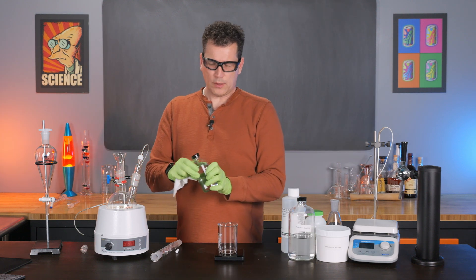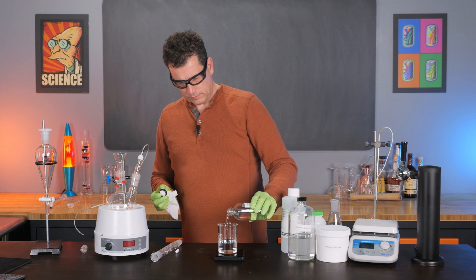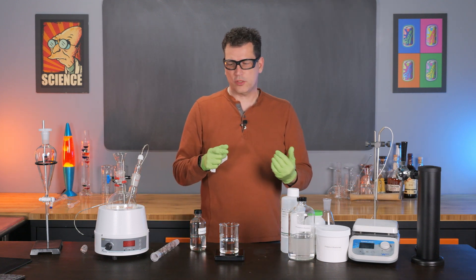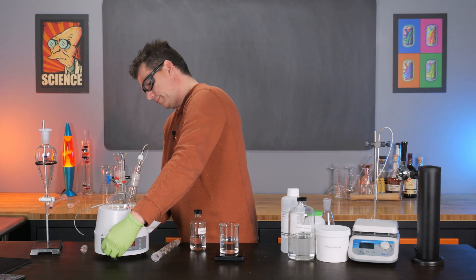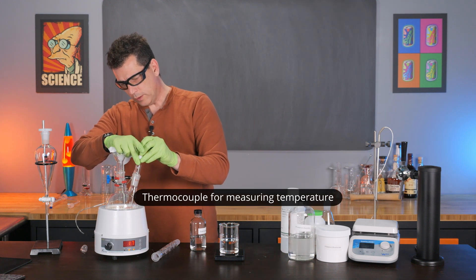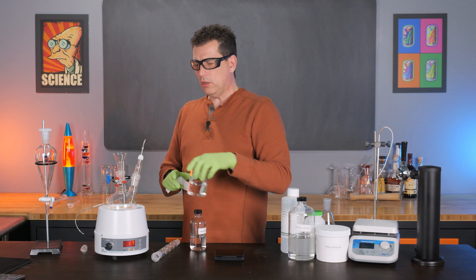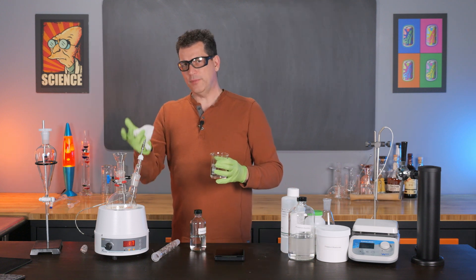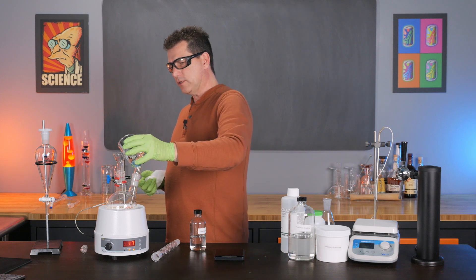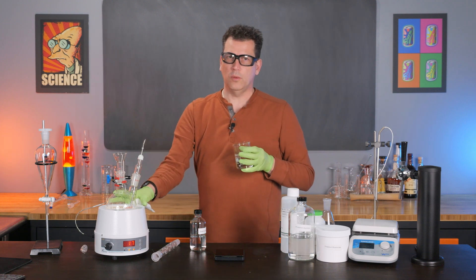The next step is to add 100 mls of isoamyl alcohol — we got 99.88, which is close enough. I want to add a magnetic stir bar, turn this on, and get some stirring going. When you add the alcohol to the formic acid, do it slowly — it may generate heat. I don't believe it produces enough heat to boil anything, but you do want to go slow and keep lots of stirring going just to make sure you don't produce too much heat.